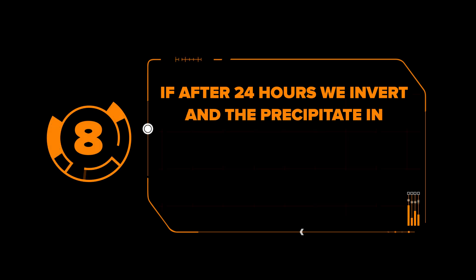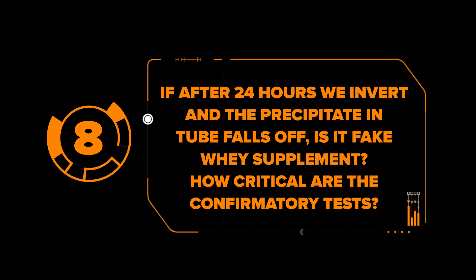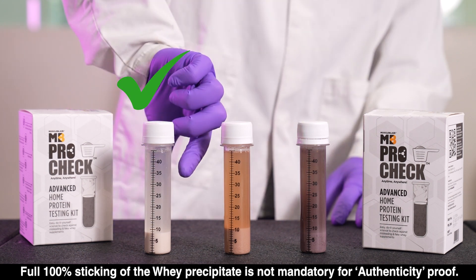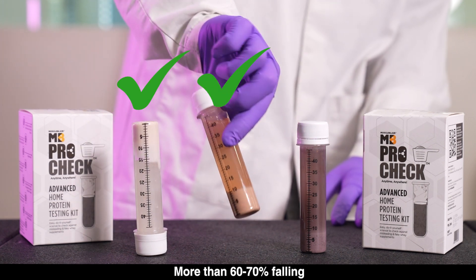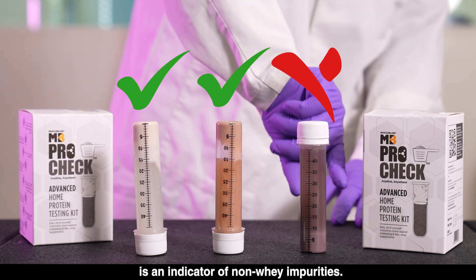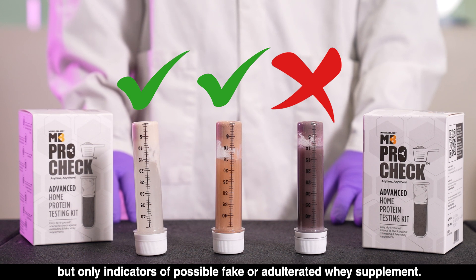Mistake 8: If after 24 hours we invert and the precipitate in the tube falls off, is it a fake whey supplement? Full 100% sticking of the whey precipitate is not mandatory for authenticity proof. Up to 30 to 40% falling of the solidified precipitate back into the solution is okay. More than 60 to 70% falling of the whey precipitate back into the solution is an indicator of non-whey impurities. Confirmatory tests are not the main protein percentage determining tests, but only indicators of possible fake or adulterated whey supplement. Happy testing!